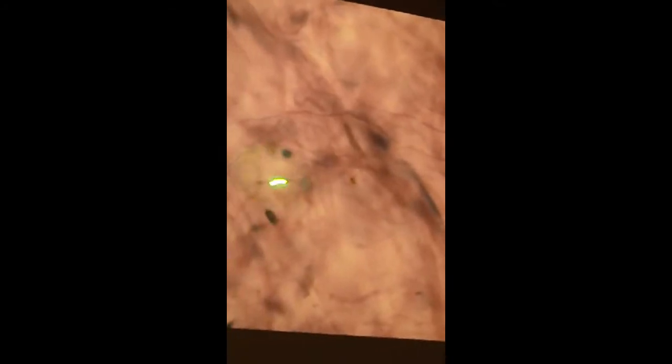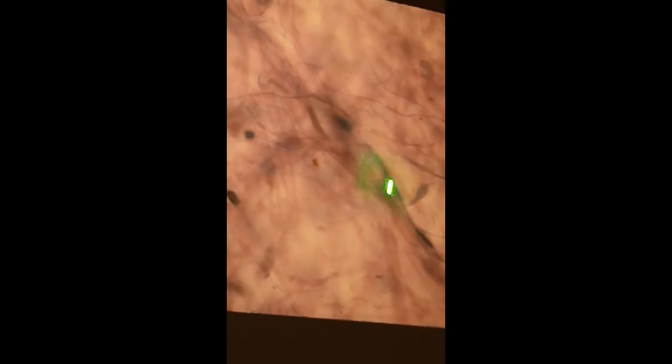And here, you get a sense that there might be one going like that. They're kind of in shadows. If you focus deeper, you might get a better focus on those collagen fibers. I find that it's best with mesentery to use a lower power. You can see here, at higher power, something happening right there that could be a collagen fiber. So you can see very nicely the elastic fiber. It's like a fibroblast right there.